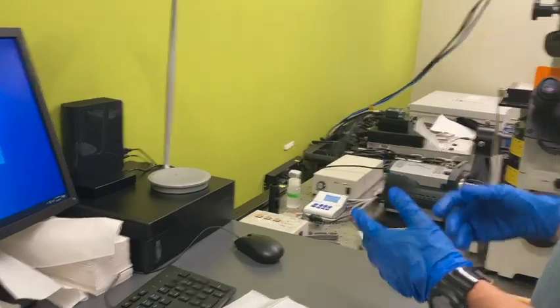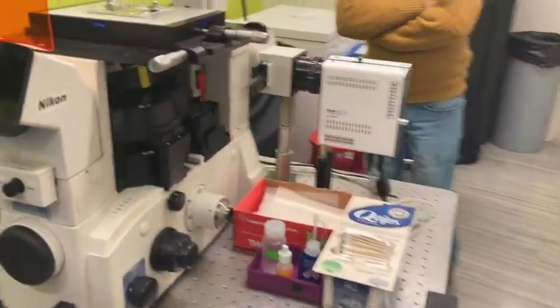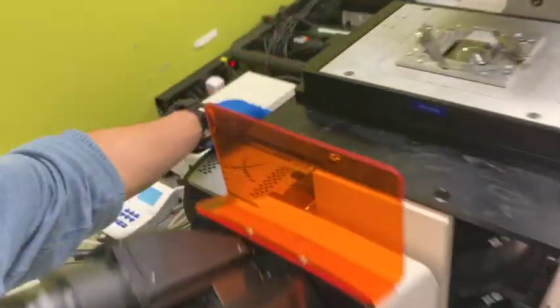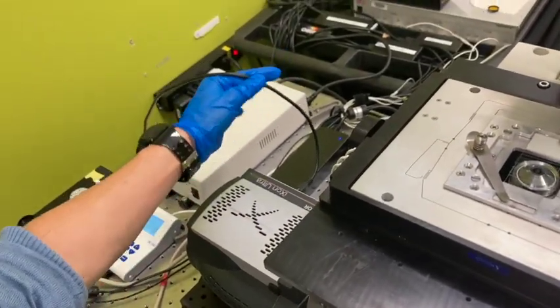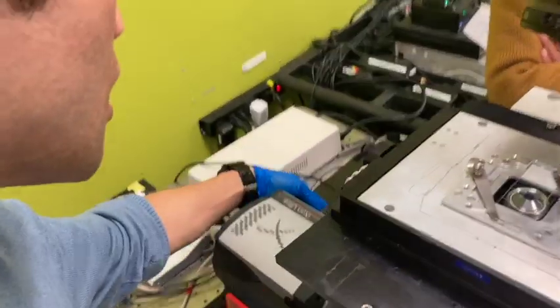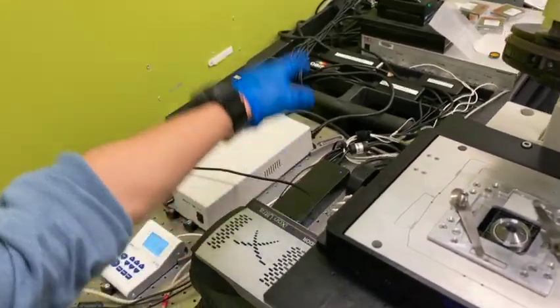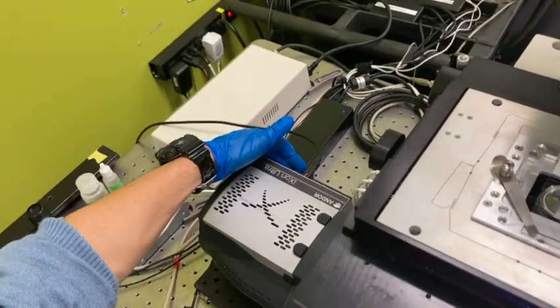Okay, I want to show how IRM works, so I need to turn on the camera. This camera, we have this USB connected to the computer. We have the power cable there. So once the main power is on, there's another switch over here.